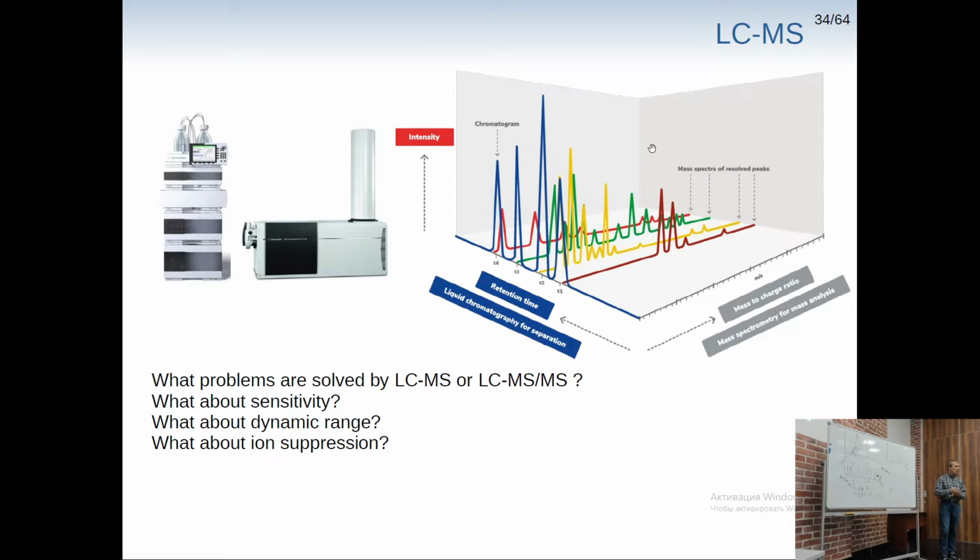Also, what is quite interesting, if you want to do MS/MS during electrospray ionization, what kind of charge are we most interested in? Multiply charged ions would be the ones we want to use for fragmentation. So we can add another rule.